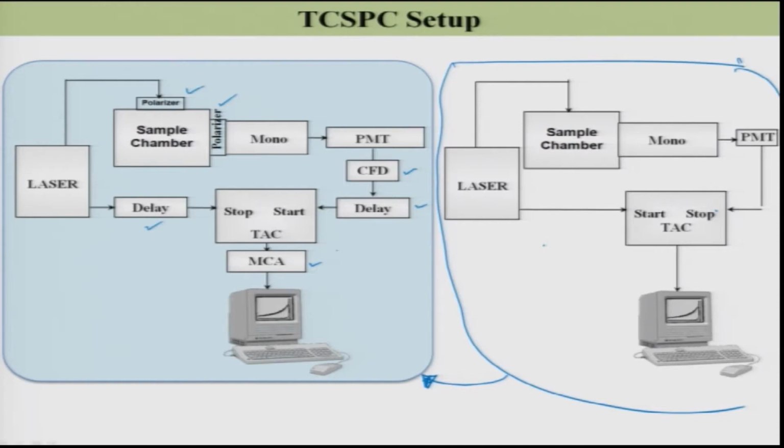So, to discuss the necessity of the CFD, delay, or polarizer, we need to discuss a little more about the different components of this basic TCSPC setup. Let us start from the laser part. Laser is an abbreviation of Light Amplification by Stimulated Emission of Radiation.